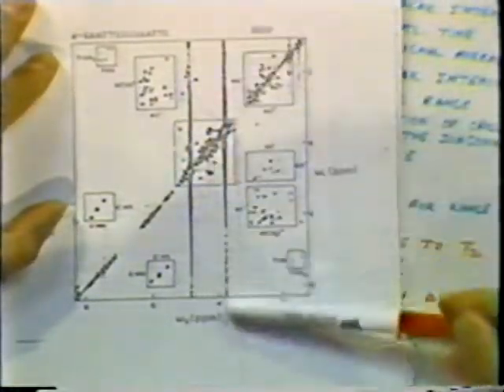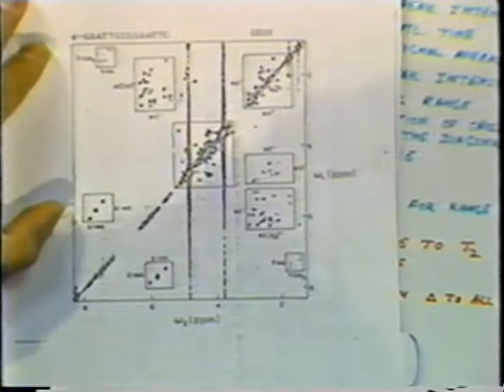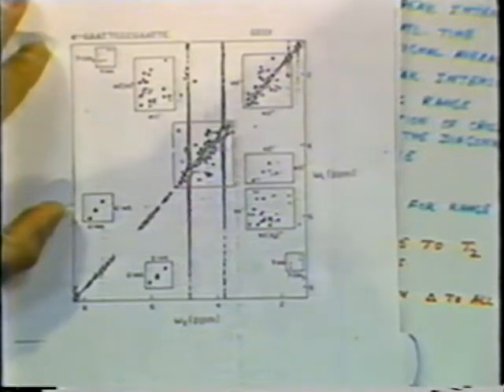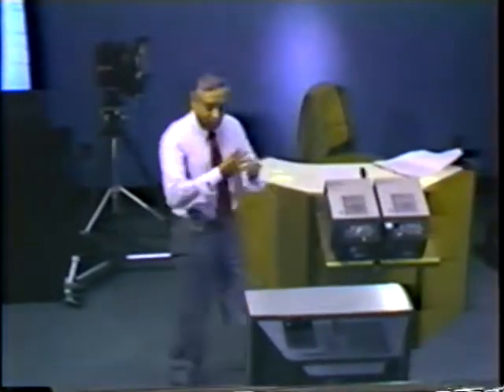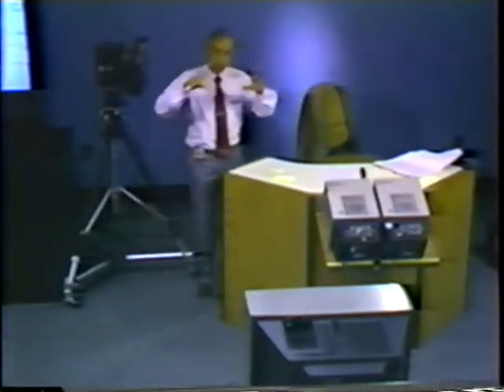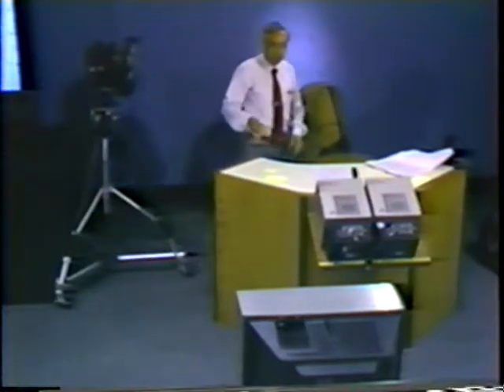These long ridges that run across are very annoying, come from several factors. Not all of them have been identified so far. And I think there are several sources which have been identified. One of the main reasons is that if you have a sharp line, it has not decayed fully before you cut off the signal. It gives you sinc tails all along.